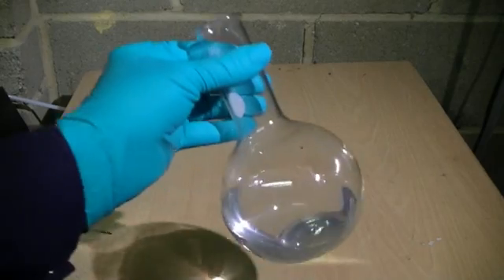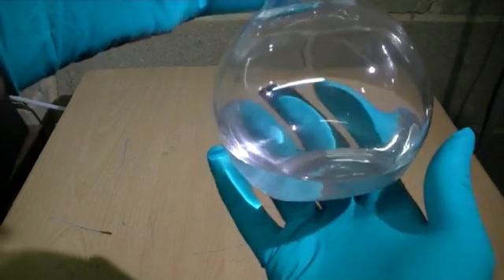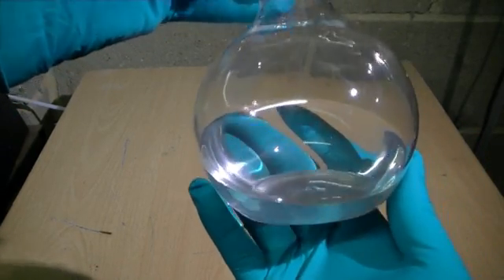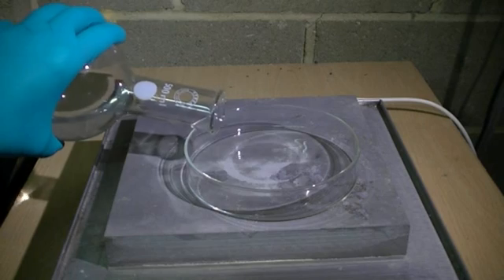Zinc sulfate when dissolved in water is a clear transparent liquid. To remove the water and leave behind the zinc sulfate, we pour our solution into an evaporation dish and allow the water to evaporate.